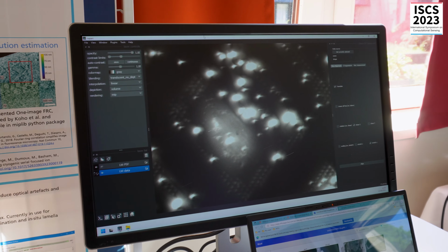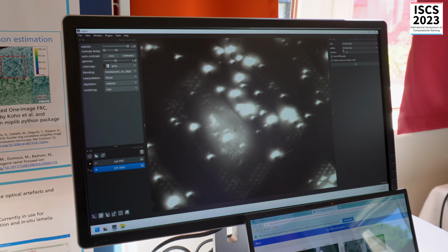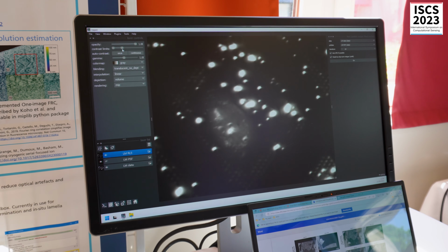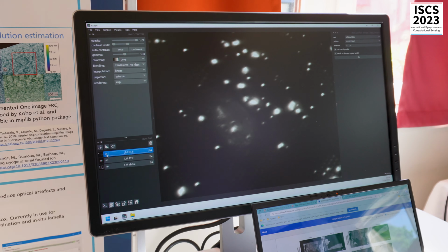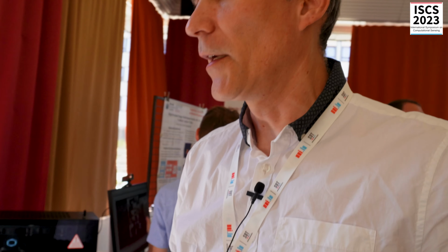But after you do this correction with the plugin, which is here, I'm not going to run it, I'm just going to show the result, which is here. It looks much sharper. Those beads appear much sharper than the previous ones. You compare that with this. More important is the location of the cell. It's got much more precision, which is important feedback for experimentalists who want to create lamellas and then target them for FiB milling and things like that.